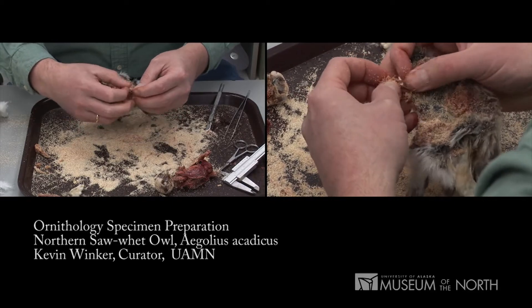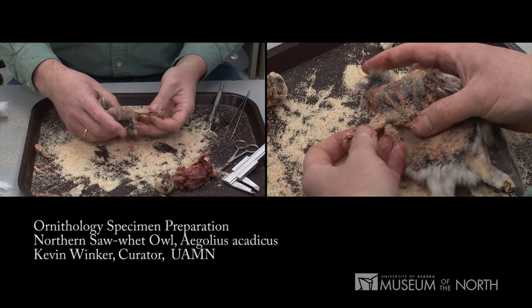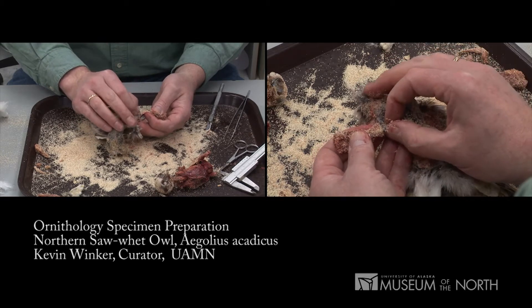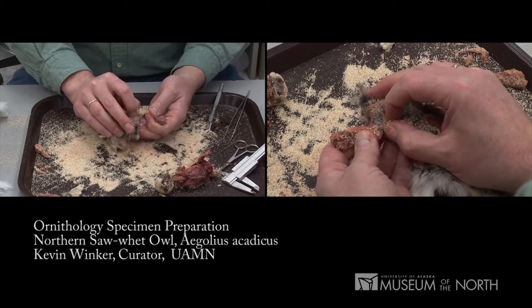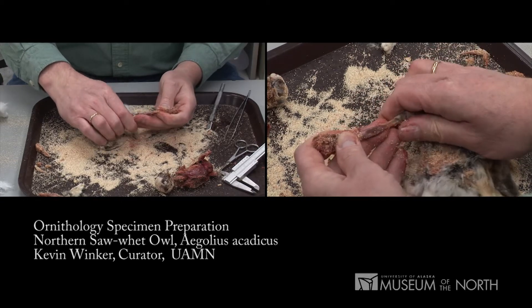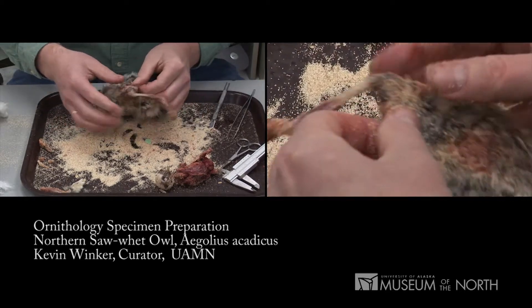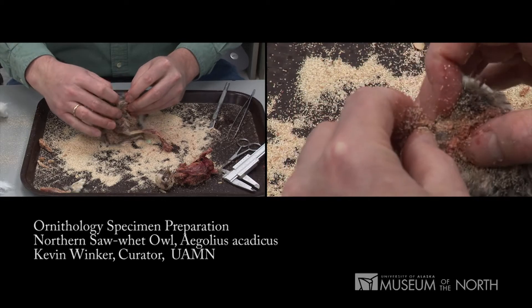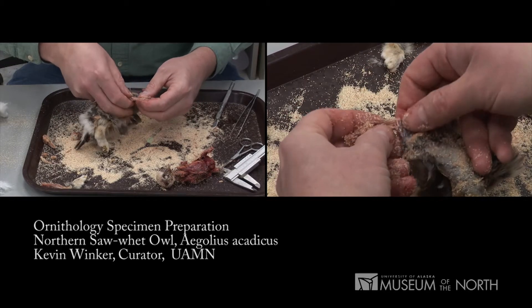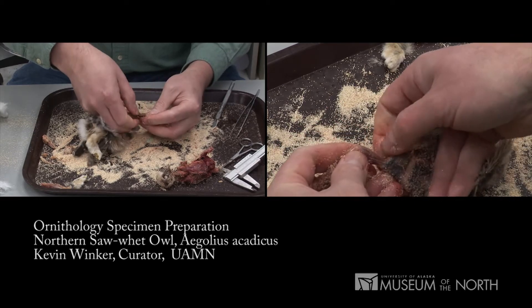We're going to do the wings now. We disarticulated those at the shoulder, and now what we need to do is take them out of the skin itself. In birds, the secondary flight feathers are attached to the ulna. This is the humerus coming to the ulna, and you have to push those away with a thumbnail — you can't pull or it'll rip. This wing has all of its bones intact, so that's a good quality element for our partial skeleton. It feels as though the same is true of the other wing.